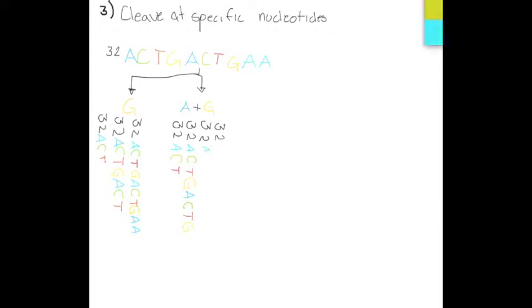With the addition of dilute acids, adenine bonds will break easier, giving more adenine breaks. This means that brighter bands in electrophoresis will correspond to adenine breaks, and the lighter ones to guanine breaks.